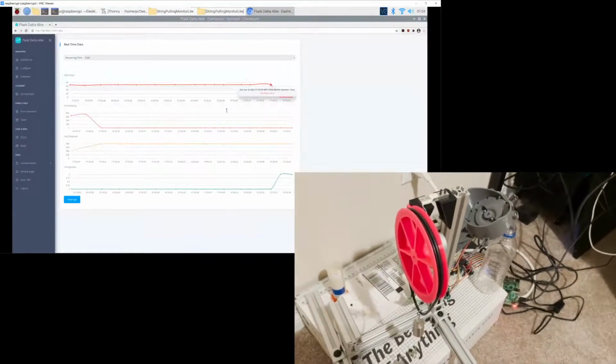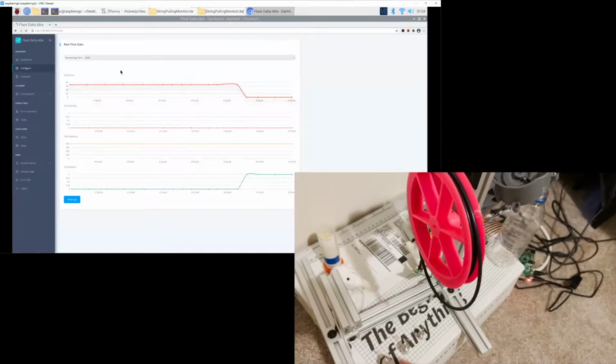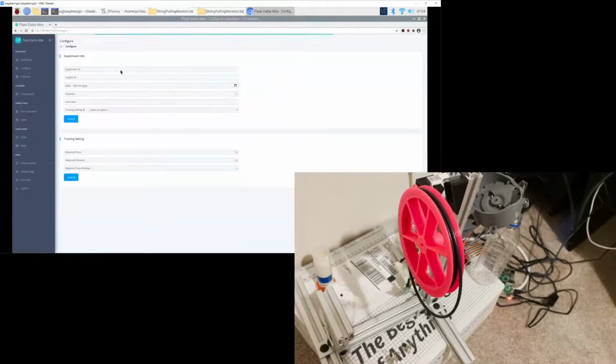When the optical sensor integrated in the food dispenser detects a successful food drop, the dispenser will stop spinning. And now let's set up another task to test the interrupt function.